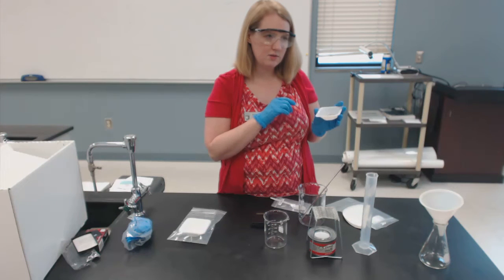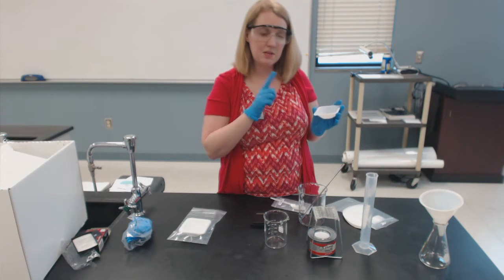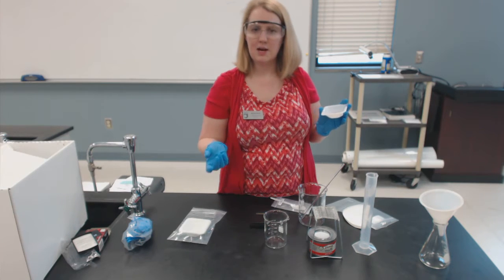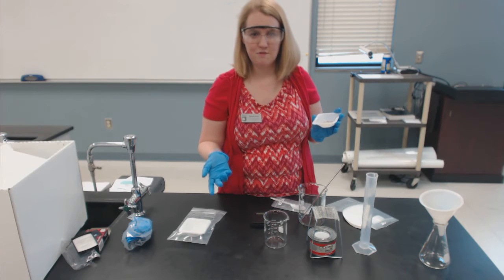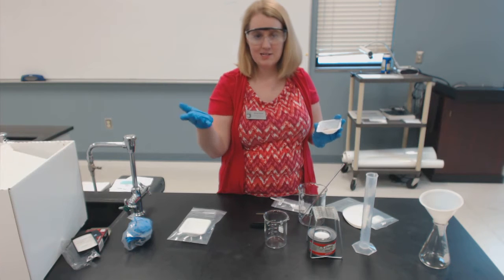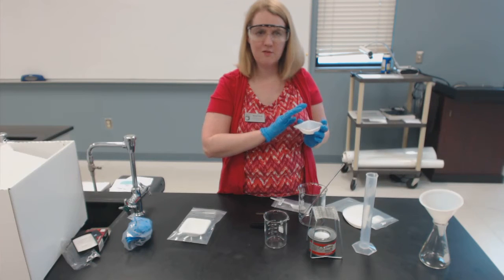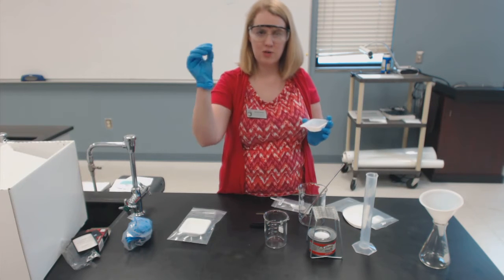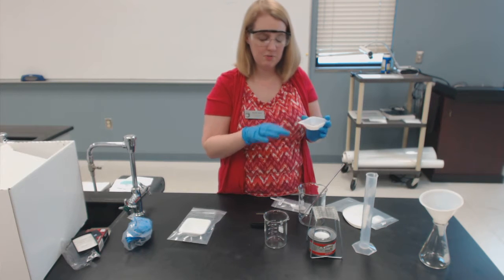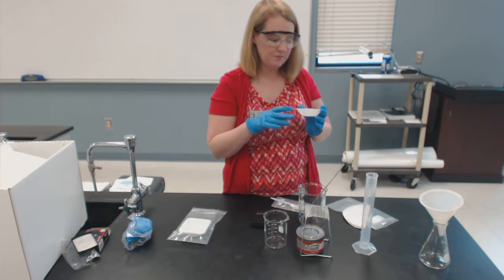Now, ammonium chloride and salt are both water soluble, so water alone would not be able to separate them. But something that does separate them, ammonium chloride sublimates at high temperature. Sublimation is the phase change that goes directly from a solid to a gas at high temperatures. You have to heat it up, in other words. That isn't going to happen if it's dissolved in water. I'm saying solid to gas, so you have to be a dry solid in order for that to work. And it happens pretty rapidly. Our little sterno lighter that comes in the kit is going to be hot enough to make this happen.